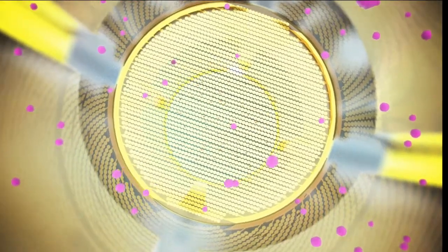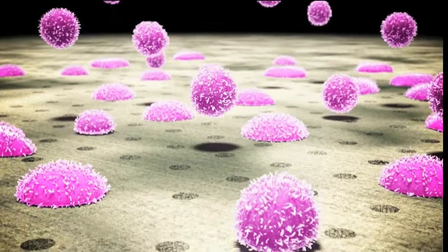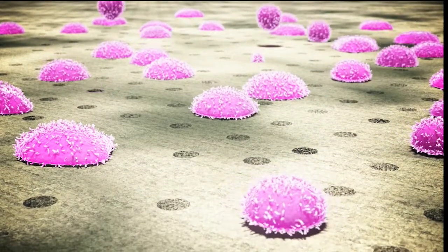As cells make their way through the ECM gel, pass through the porous membrane, and adhere to the gold electrodes, the system measures the level of electrical impedance.